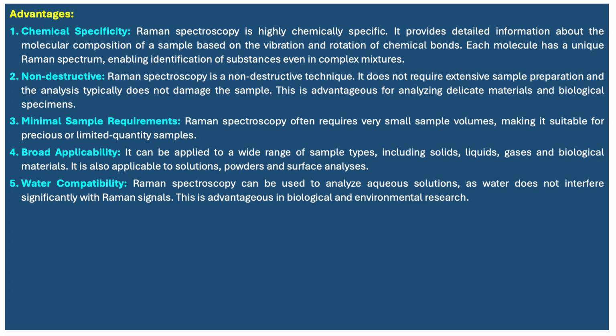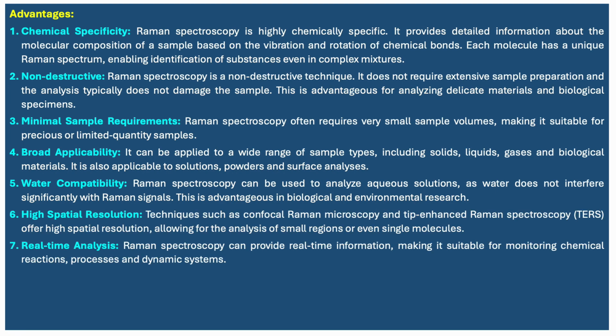It can be applied to a wide range of sample types including solid, liquid, gas and biological material. It is also applicable to solutions, powder and surface analysis. Raman spectroscopy can be used to analyze aqueous solutions as water does not interfere significantly with the Raman signal. This is advantageous in biological as well as environmental research.